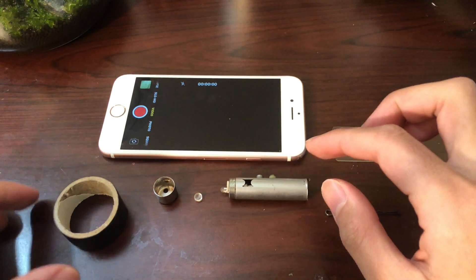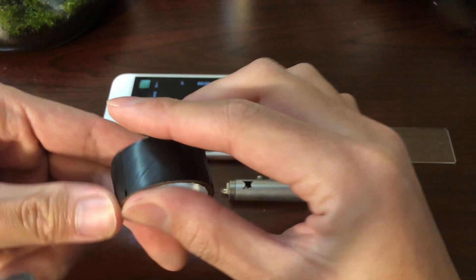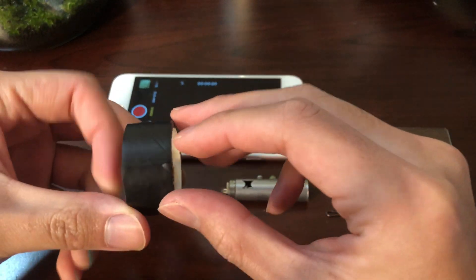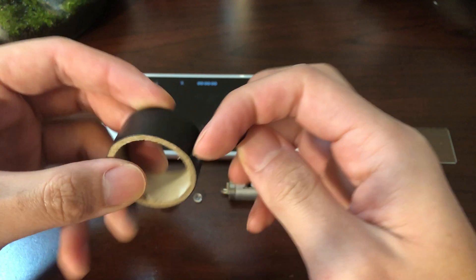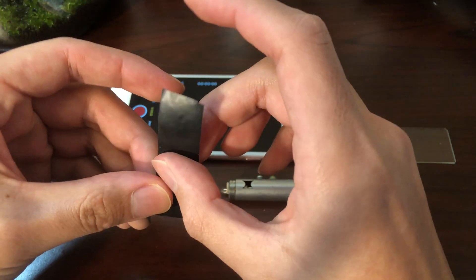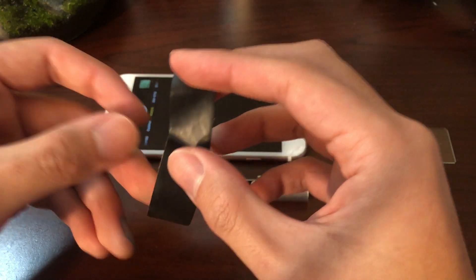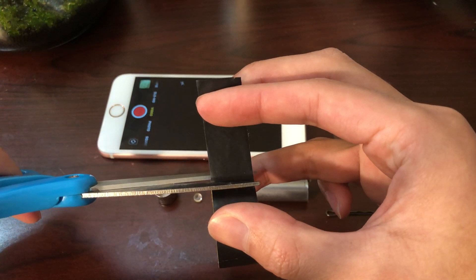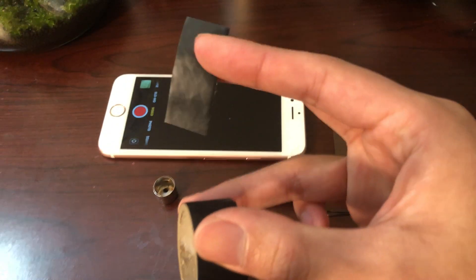First off we have some tape — this is electrical tape. You don't have to use electrical tape, you could use regular tape, but I find that electrical tape is a little easier to take off and we don't want any sticky glue all over the place. I'm going to use my scissors and take off about an inch and a half.